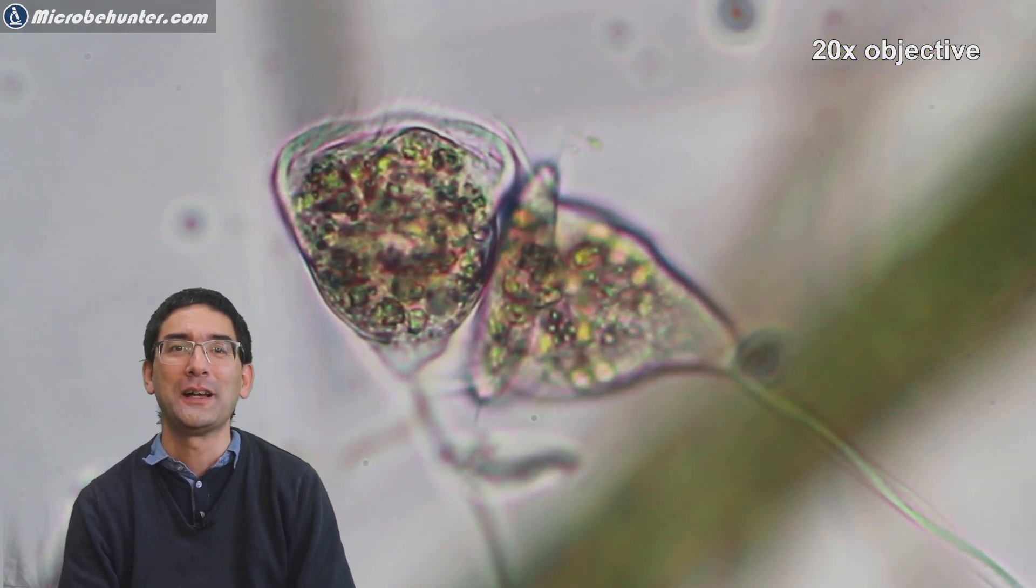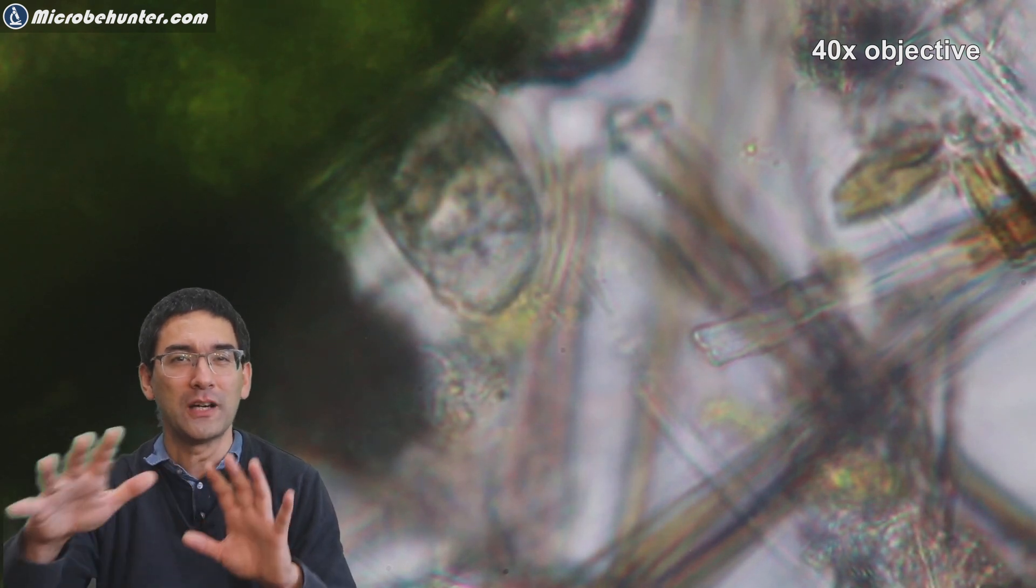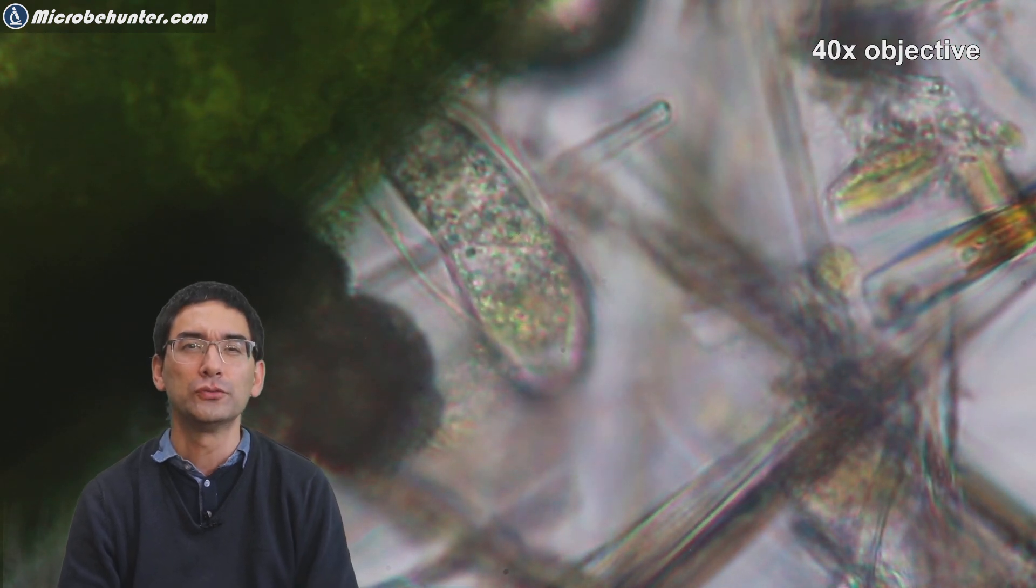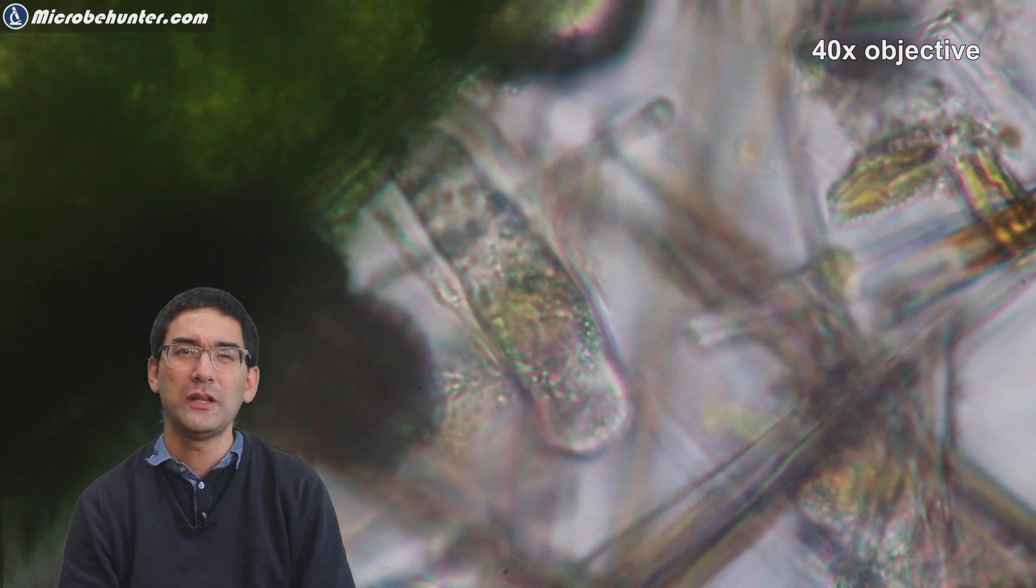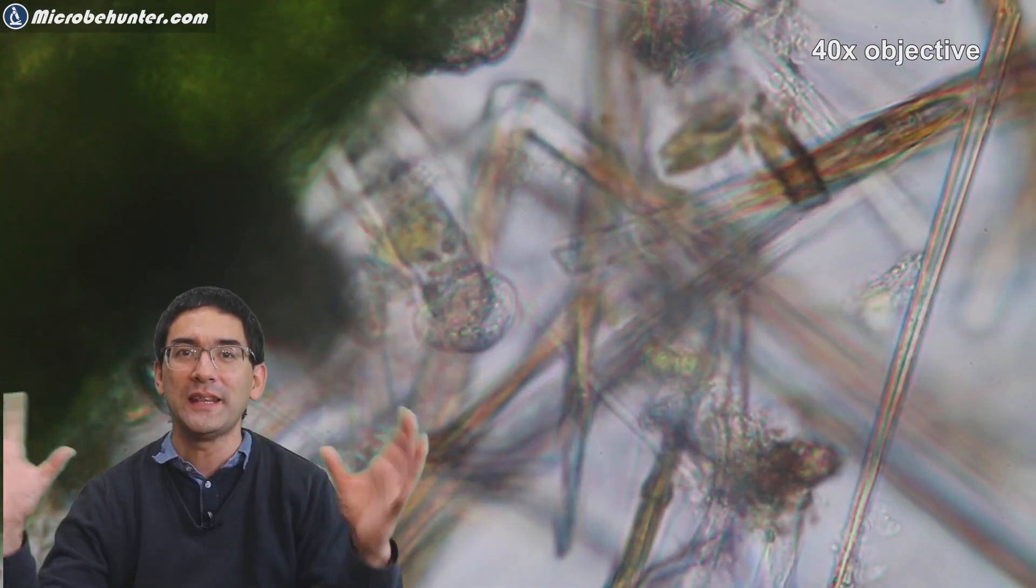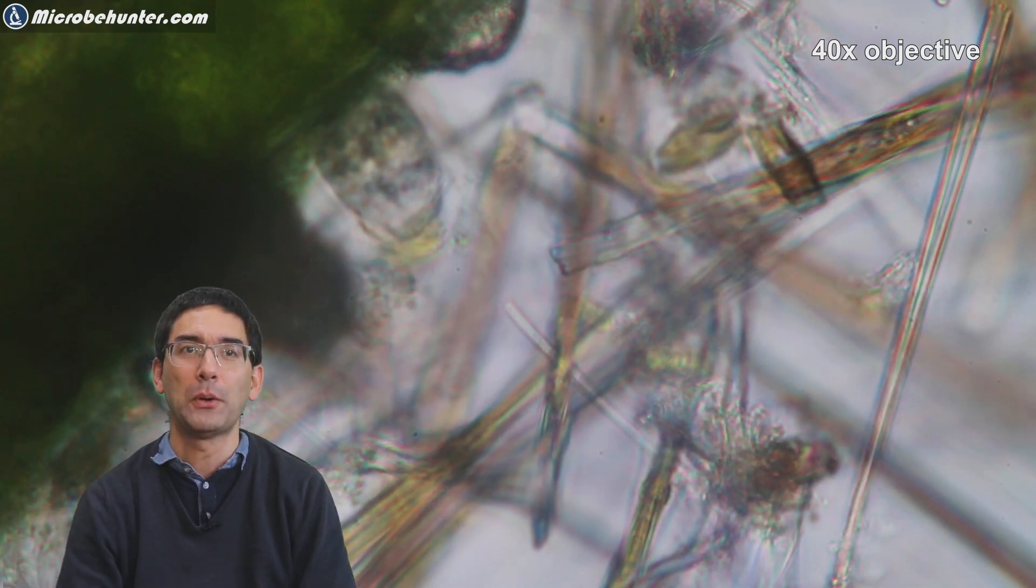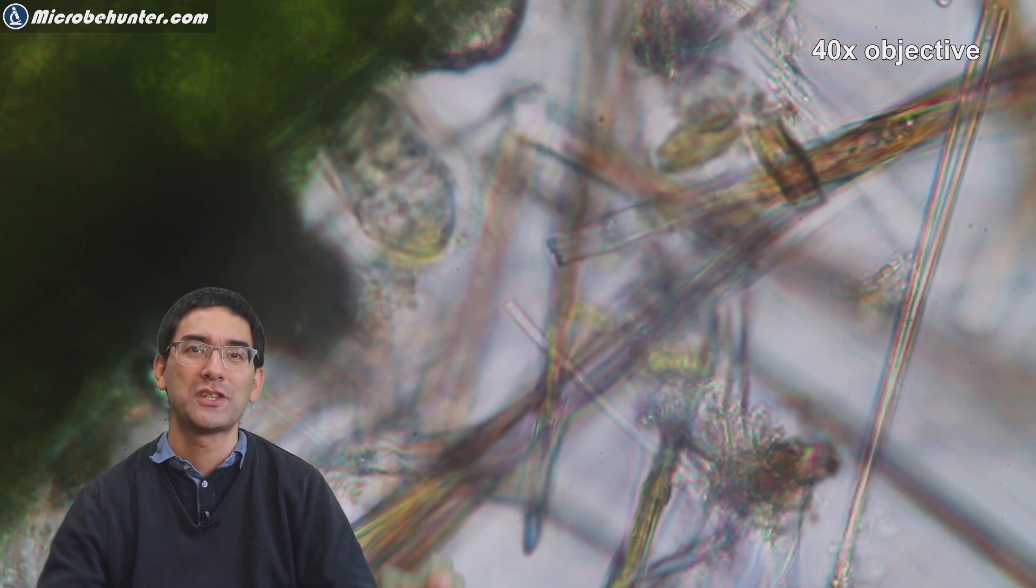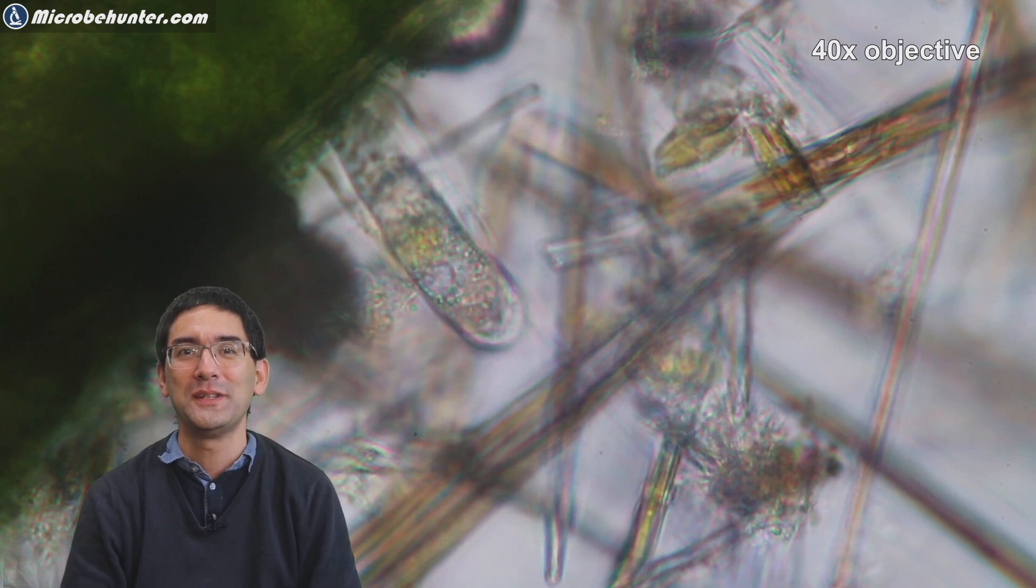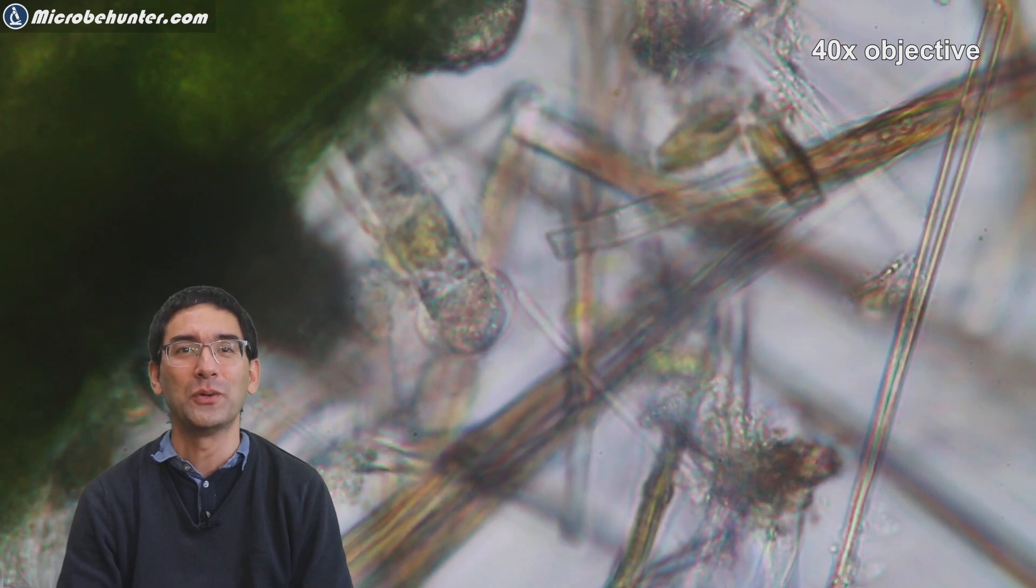This is a strange one. I know the image quality is not quite the very best because it was covered with other things as well. I wonder what this could be. It reminded me a little bit of a rotifer, but it does look a little bit different. It was also able to contract and to expand, and it also had these cilia on the surface to move the water and the suspended particles. Then again when it touched something, it quickly retracted and then extended again. This actually shows that living things do respond to their environment.